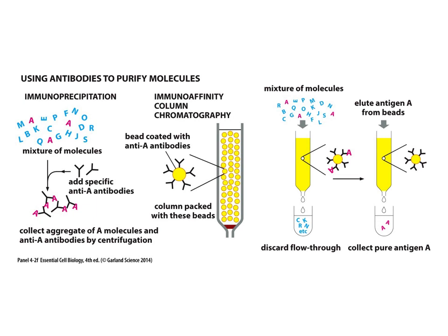We could pass that viral lysate over, right? And so all of those proteins that, at least for that individual we got the convalescent plasma from, their immune system did not respond to, would flow right through, right? But the proteins that are specific to the antibodies would get trapped.